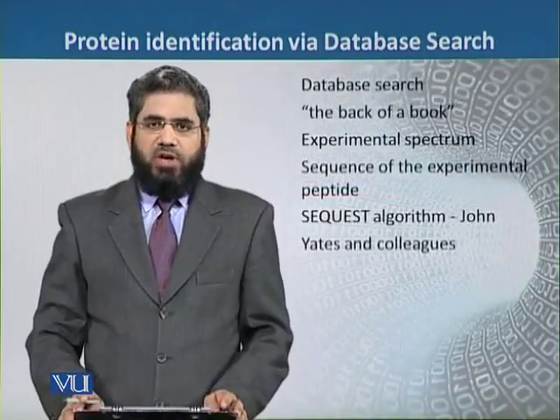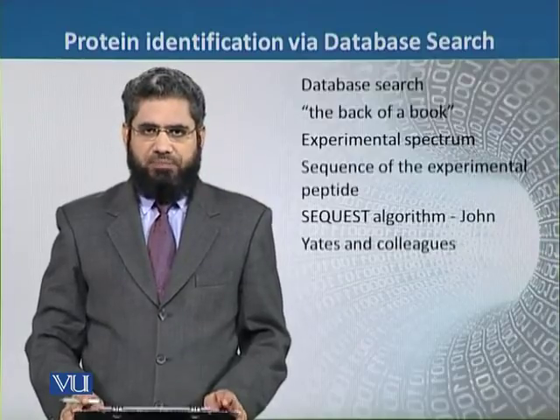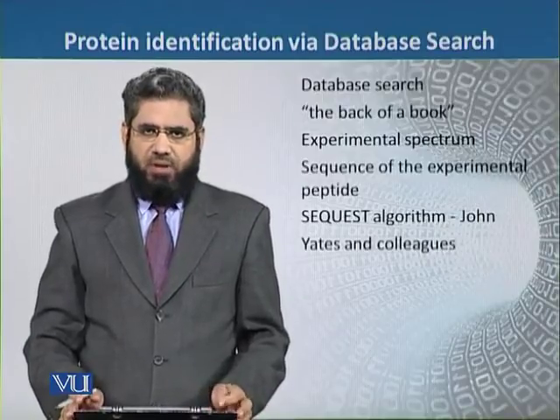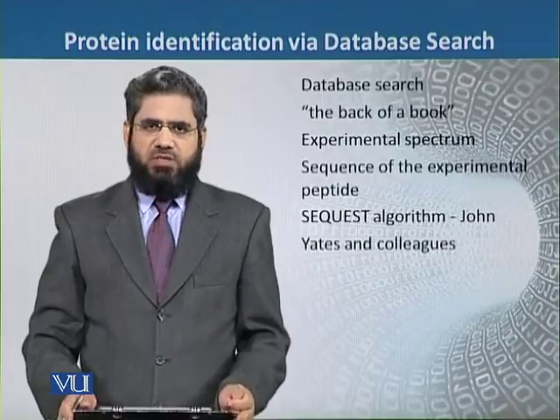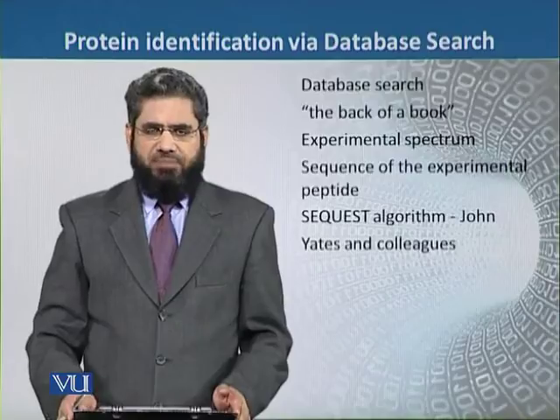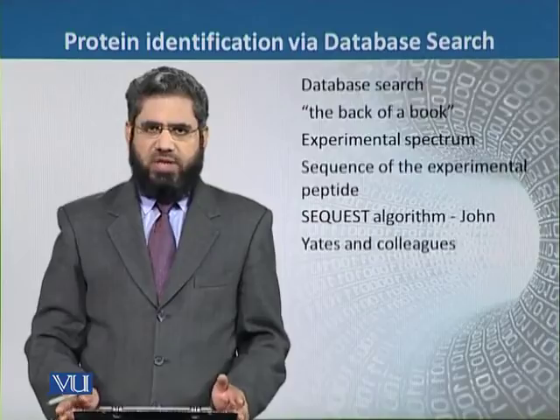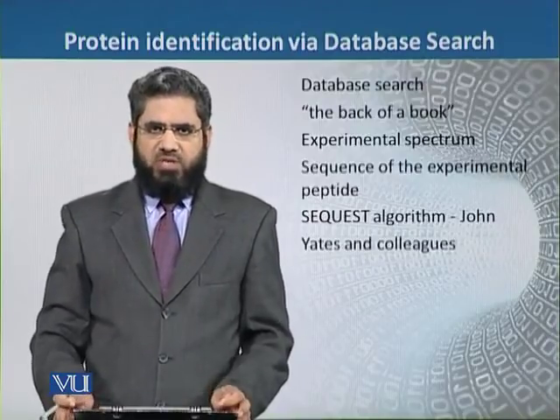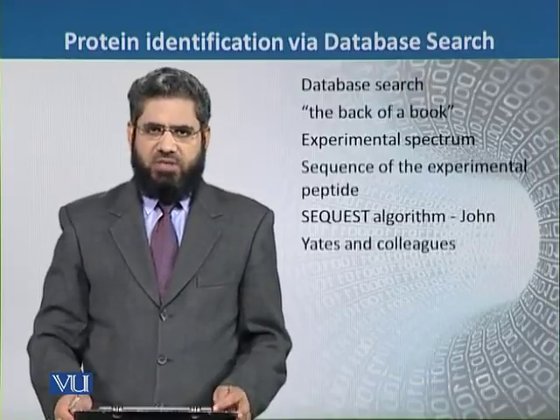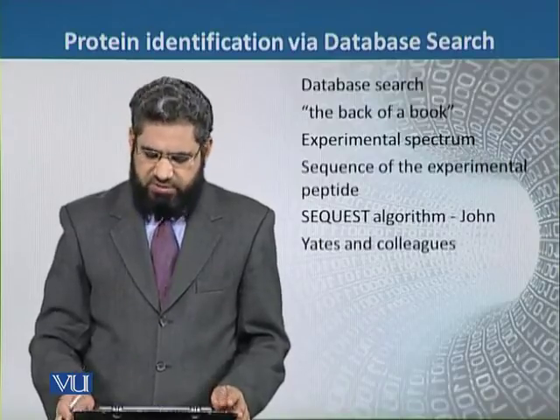Now, the approach to find and identify a specific peptide or protein is not to generate different types of peptides by using MS, but the new technique is to search for the sequence of the protein in already existing databases. For example, if we want to find the answer to a problem in a textbook, we just find the answer in the last pages of the textbook. Similarly, we just compare the sequences of these peptides with those present in the databases.